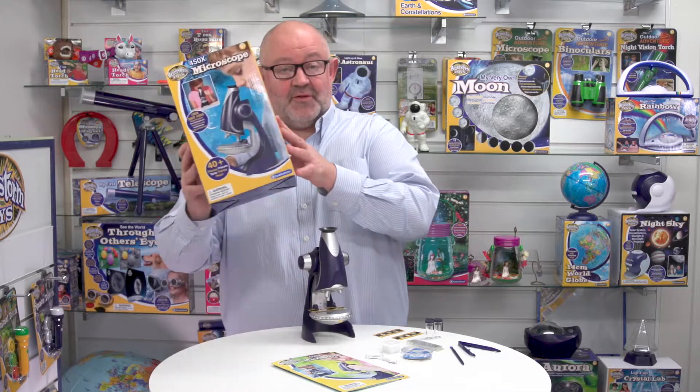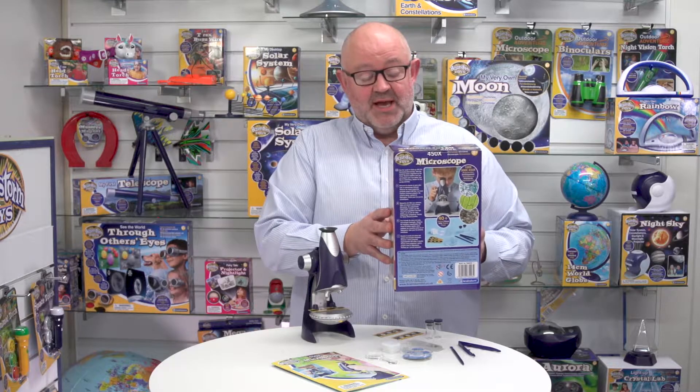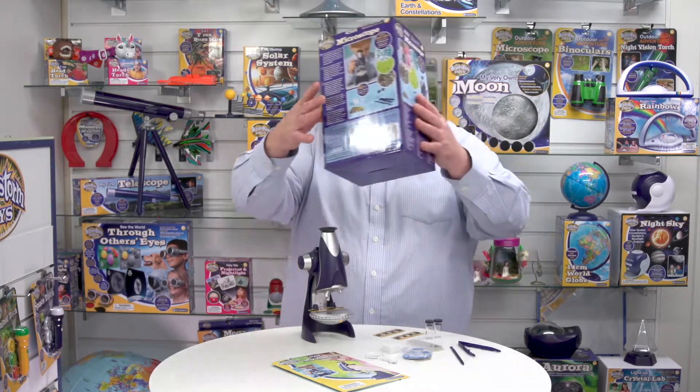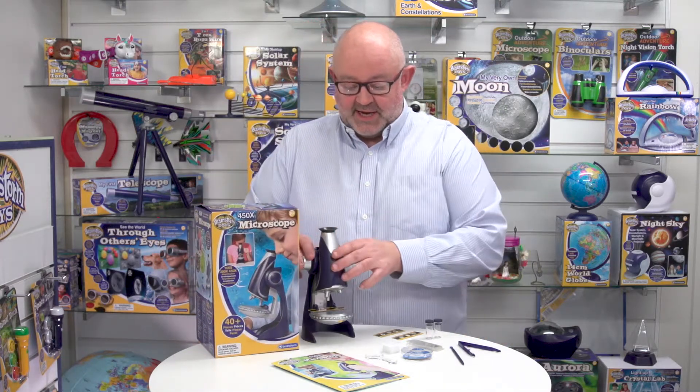This is the 450x microscope from Brainstorm Toys. Starting off just looking at the box, it's a fully solid box and on the back you'll notice the languages — this is in five languages, and that goes for all the safety instructions, all the call-outs on the box, and of course the educational manual that goes with this item.